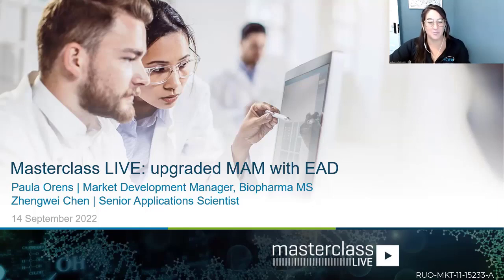Today's agenda for Masterclass Live, one of my very favorite sessions, is about setting up and monitoring quality attributes for protein therapeutics, a technique more commonly known as multi-attribute monitoring, or MAM. Throughout the next hour, my very esteemed colleague and I will be taking you through how you can do that, MAM, to get the most out of your amino acid isomerization and localization.